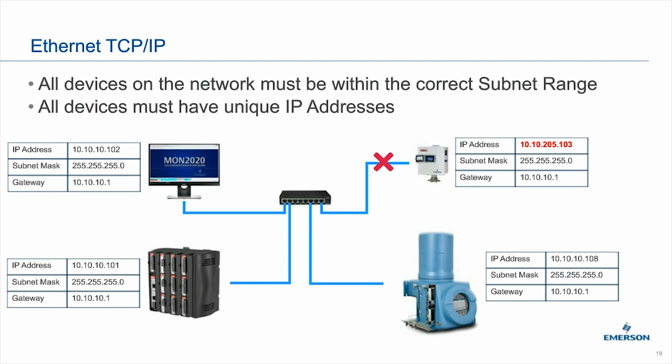We don't have the wireless adapter inside the GC itself, simply because there's a lot of options out there for wireless connectivity, and there's also a lot of issues with having a wireless hub inside an explosion-proof enclosure. And to be honest, because of security concerns, there's not that much call for wireless networks in the industrial environment, although that is changing. It is standard wireless Ethernet, exactly the same as the Wi-Fi you might have in the office or at home, so you would be using off-the-shelf components for that.